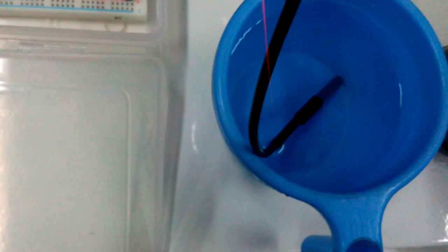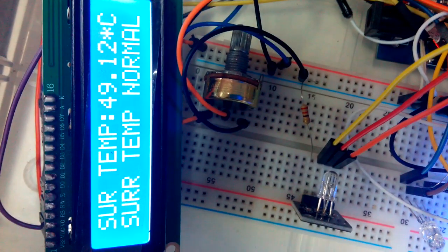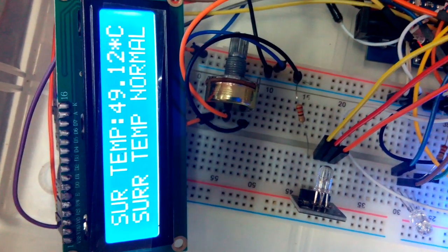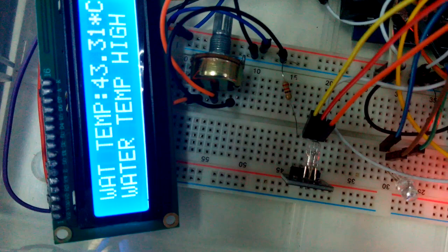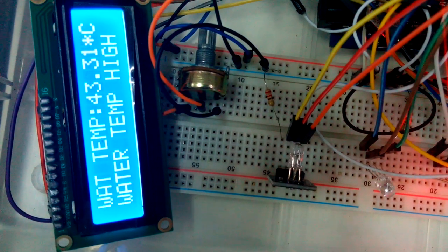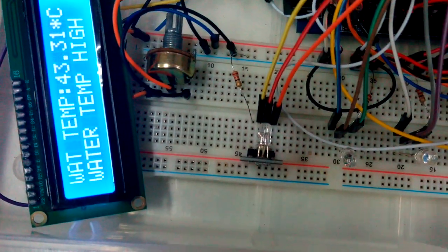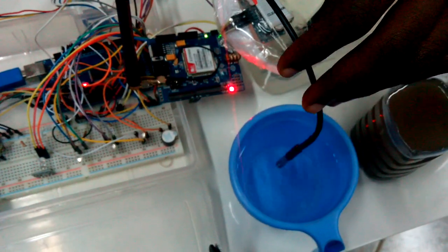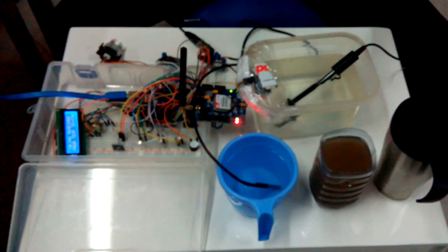We take the probe out and now use it for the hot water. I dip the probe into the hot water. For the surrounding temperature it is still normal. The temperature has now risen from 13 to 43.31 degrees Celsius, for which the water temperature is high — because I used hot water. So now we are done with the temperature. We can measure the temperature of cold water, hot water, and also the surrounding temperature.